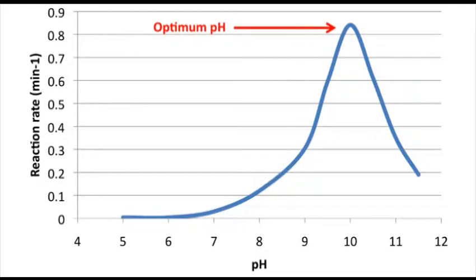It's really important when designing an experiment that we think about whether we are making assumptions and whether we can justify making them. Now that I have my results, I can plot a graph of reaction rate against pH, and here it is. From this we can see that the phosphatase I have been given is an alkaline phosphatase, and it has a pH optimum at pH 10.